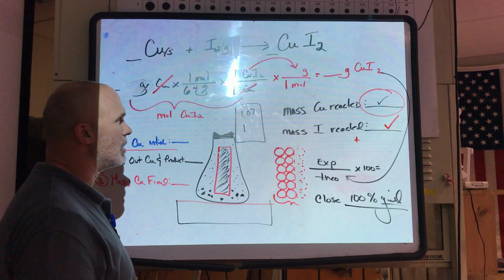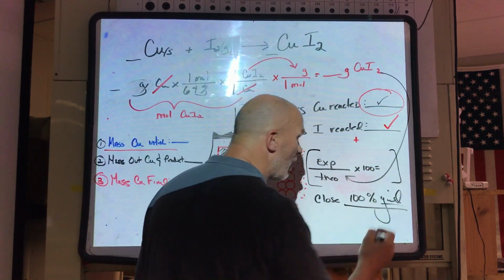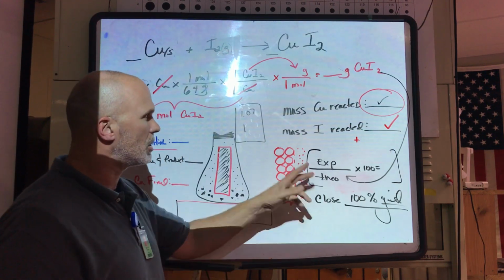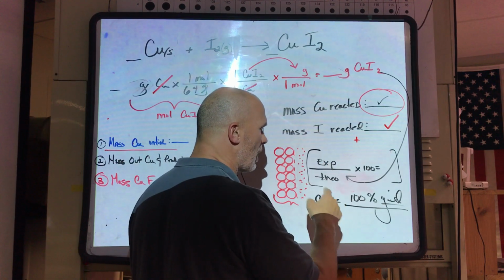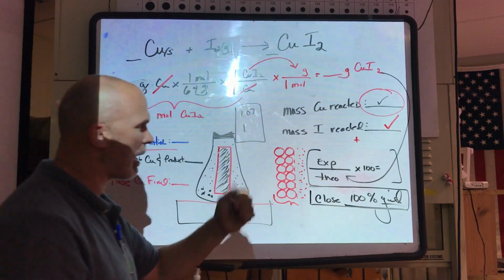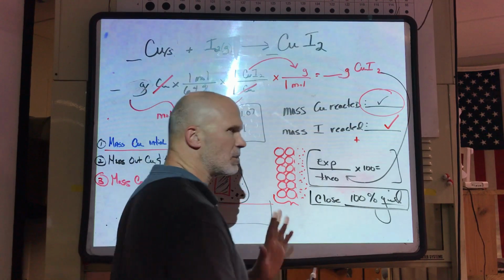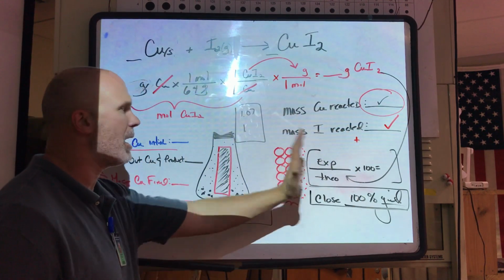All right, so in any case, you're not subtracting, you're not doing a percent error, and you should know that a percent error is how close one number is to another number, okay? This is just showing us a percentage of how these compare to each other in terms of what we're supposed to get. So percent errors are great when you have 0% error. Remember, you subtract there. Here, how close we are to a value. We love percent yield, especially in chemistry, talking about how much we're supposed to make.